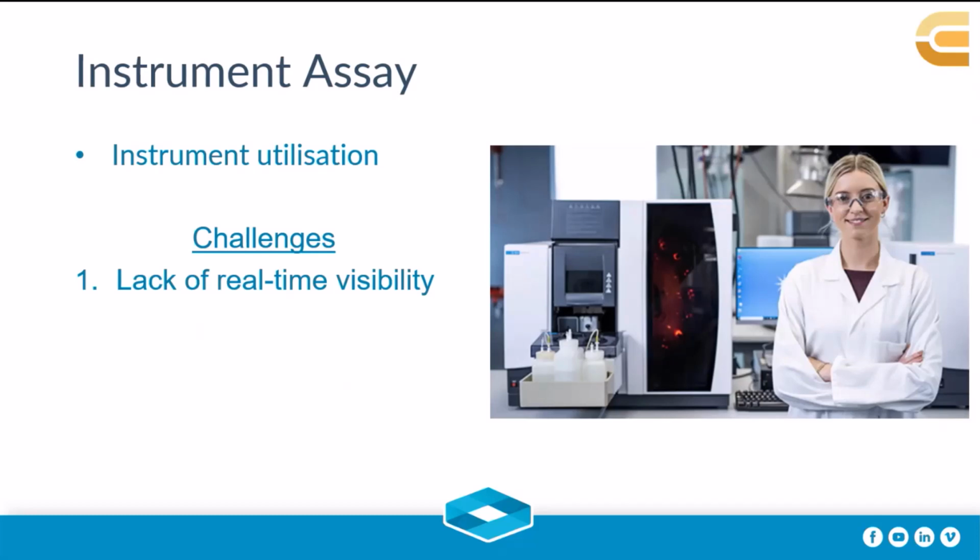So it's important to record samples that are being analyzed on the correct instrument, and also instrument utilization is difficult to record, and obviously this affects the turnaround time for your samples.